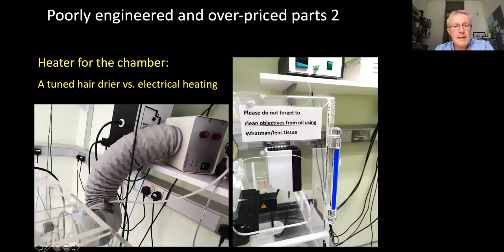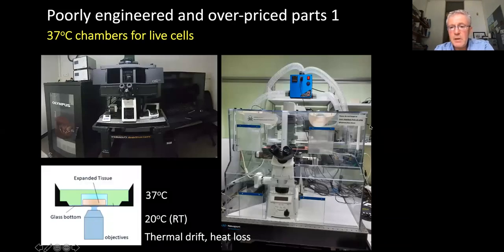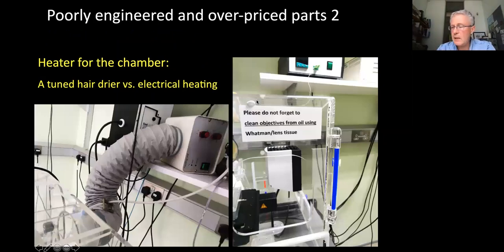And the next one is the heater for the chamber, because even here you see it's just a hot air, and what I called it's an aufgemotzter hairdryer, or a heated, well, tuned hairdryer. And when it broke, when I have seen the quotation for fixing it, several thousand €. Instead, I bought a heating element for €100 and a controlling element for another 100, and we connected it for another €25 with a probe, and this heating element serves me already for more than 10 years, and it's more accurate and makes no vibration.